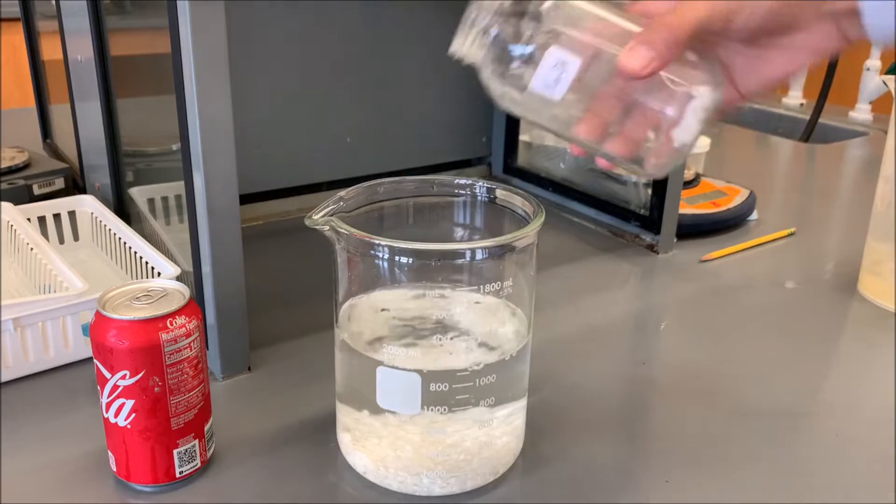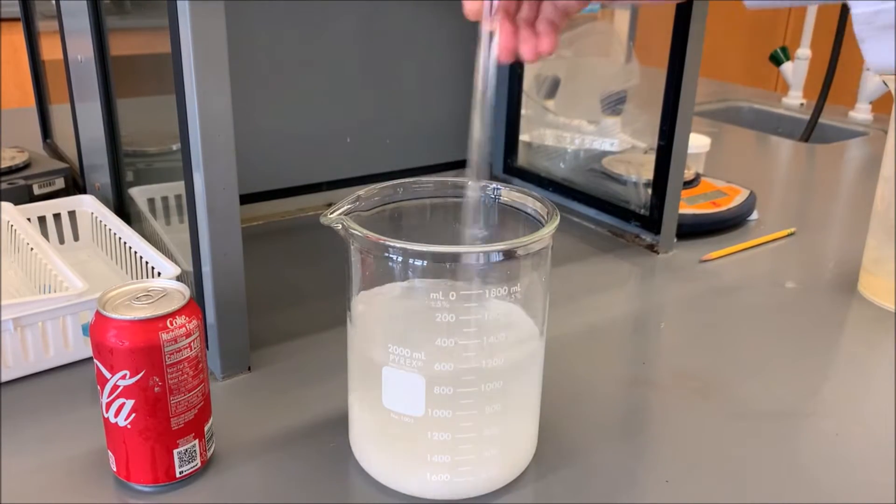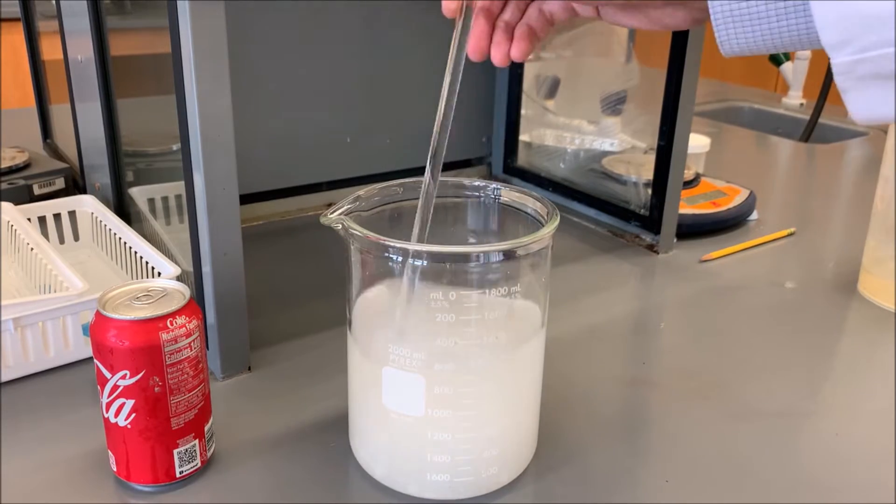As the sodium hydroxide dissolves, it releases quite a bit of heat. And once all the sodium hydroxide dissolves, we will add our can into the solution.